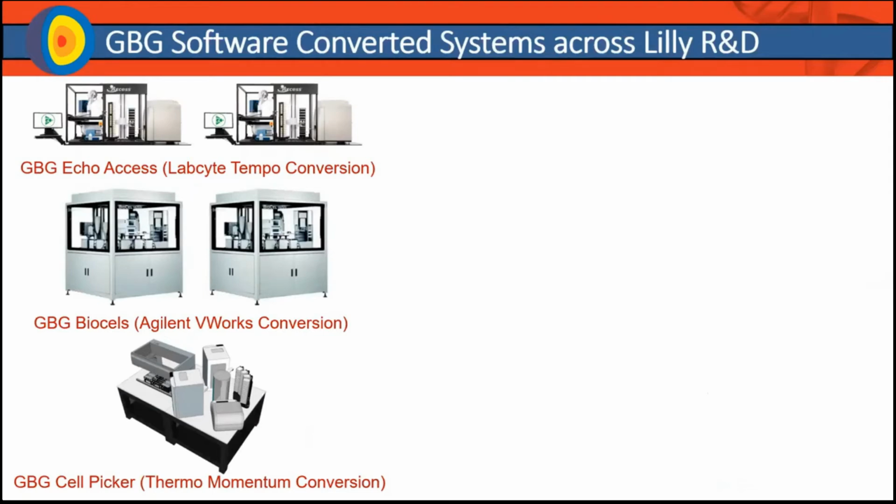Some of the systems that I mentioned have been integrated by Biosero to leverage Green Button Go. Now I want to briefly highlight some of the systems that used a different integrator and were brought in at a much earlier date into Lilly, but we've now been able to convert those systems leveraging GBG to extend the life of some of this equipment, to move us from things like Windows 7 to Windows 10, and also to give us additional flexibility and capabilities as we want to add new devices and do more with a system that may have been built 5, 6, 7, 8 years ago.